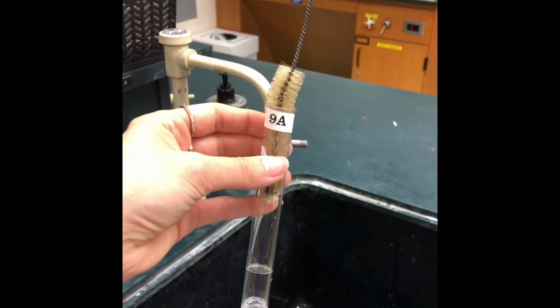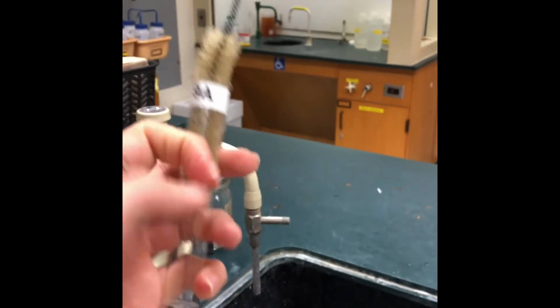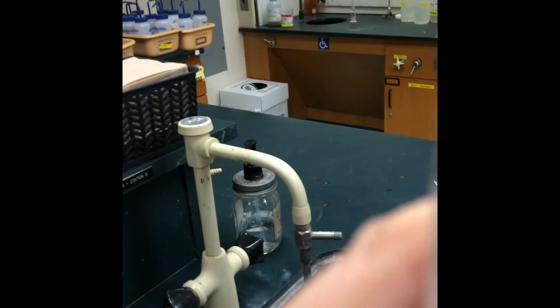Let's see if I can put this down and do this for you. Use your brush and actually scrub your test tube as you see here. And let me see if I could balance my phone into this. No.